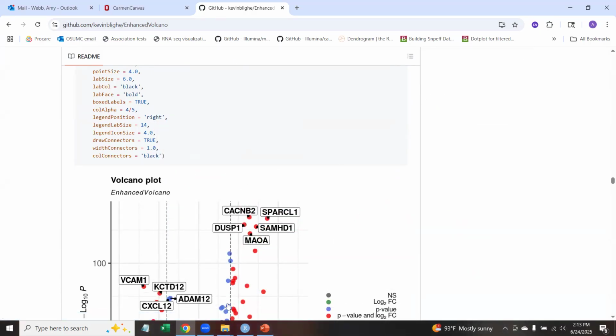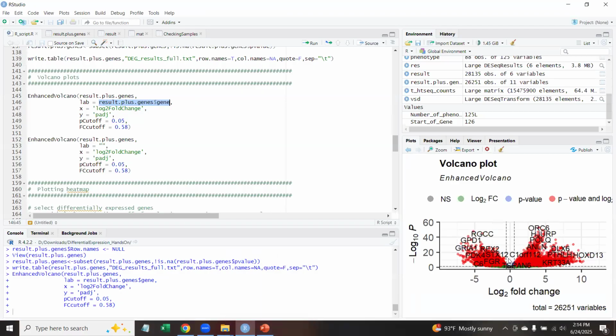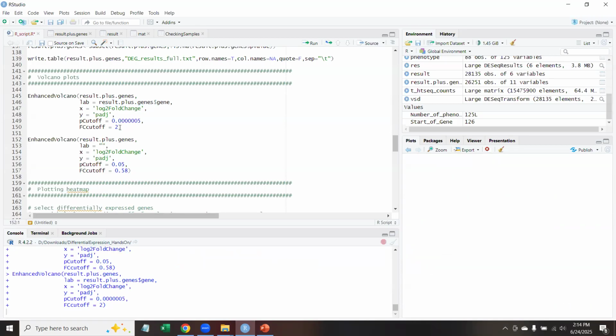I mean, if you really wanted to, you could plot a volcano plot with ggplot. You could tell it to use the log2 fold change on the x-axis, do some math on your own to transform this adjusted p-value, draw a scatter plot with ggplot, control the shading however you want with custom cutoffs. Here we can specify our cutoffs for p-value and fold change. Like if I wanted a fold change of 2 and a p-value that's very small.